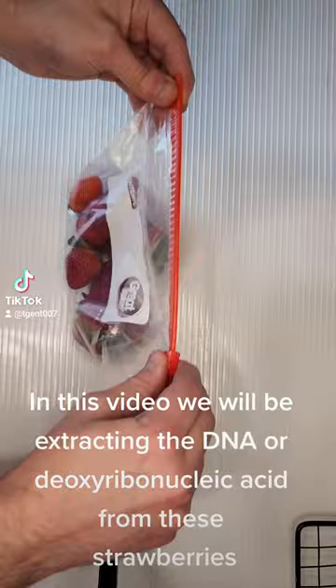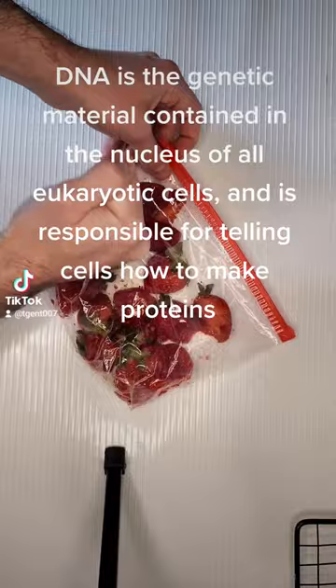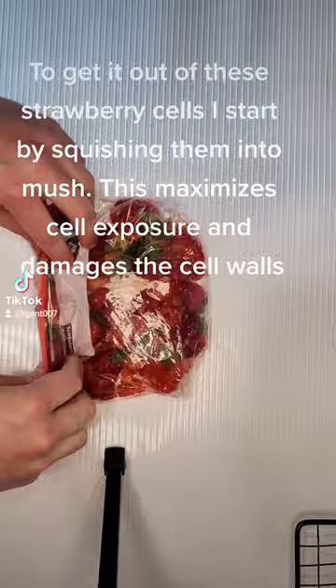DNA is the genetic material contained in the nucleus of all eukaryotic cells and is responsible for telling cells how to make proteins. To get it out of these strawberry cells, I start by squishing them into mush. This maximizes cell exposure and damages the cell walls.